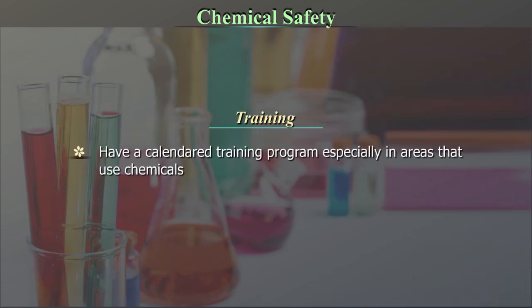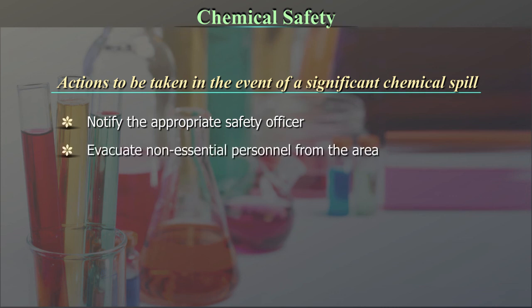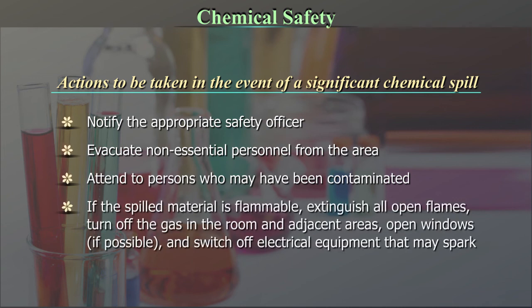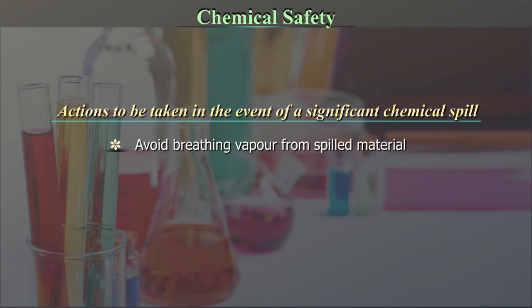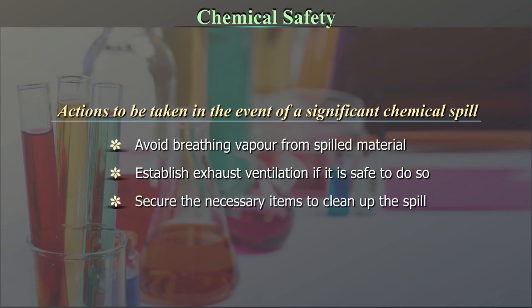Training: have a calendared training program especially in areas that use chemicals, and have evaluation of that training. Actions to be taken in the event of a significant chemical spill: notify the appropriate safety officer; evacuate non-essential personnel from the area; attend to persons who may have been contaminated. If the spilled material is flammable, extinguish all open flames, turn off the gas in the room and adjacent areas, open windows if possible, and switch off electrical equipment that may spark. Avoid breathing vapour from spilled material. Establish exhaust ventilation if it is safe to do so. Secure the necessary items to clean up the spill.